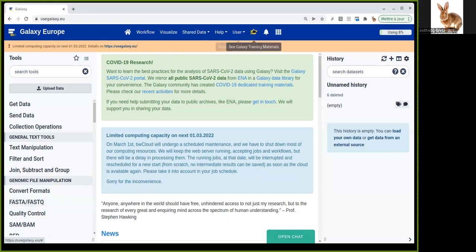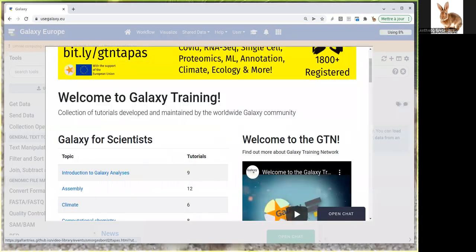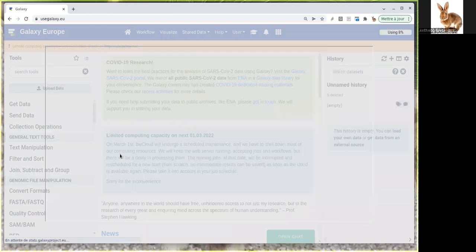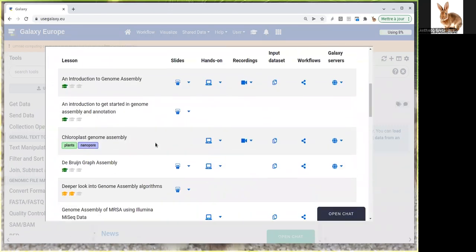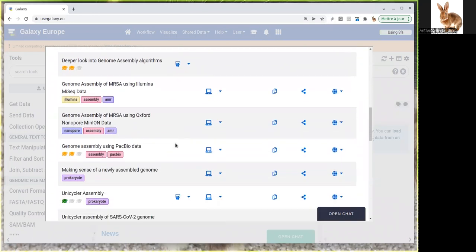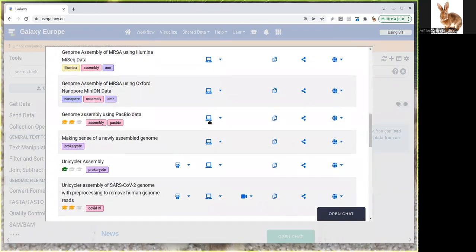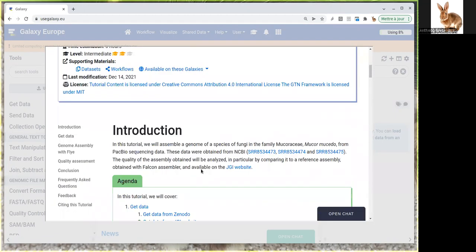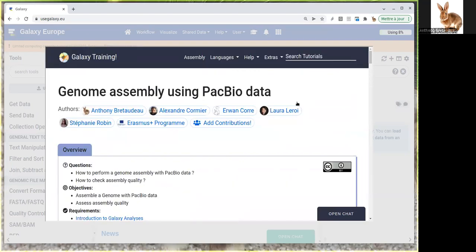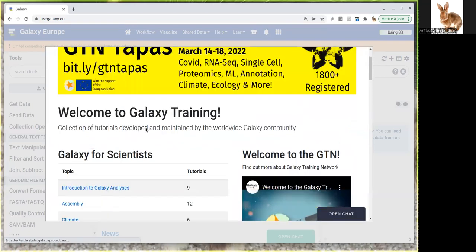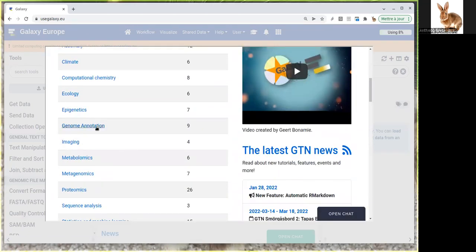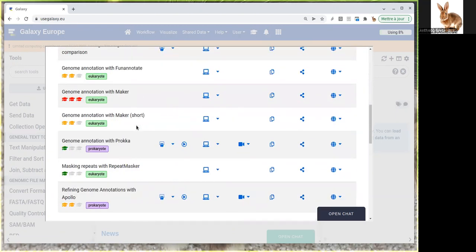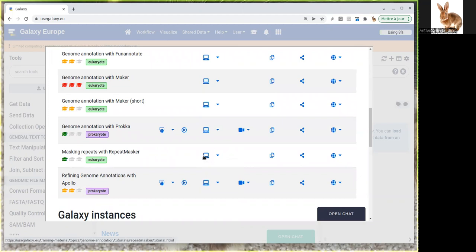I can show you here. If you follow this tutorial, you'll get an assembly of these species. After that, you can follow the repeat masking tutorial in the genome annotation section, which is here: masking repeats with RepeatMasker.